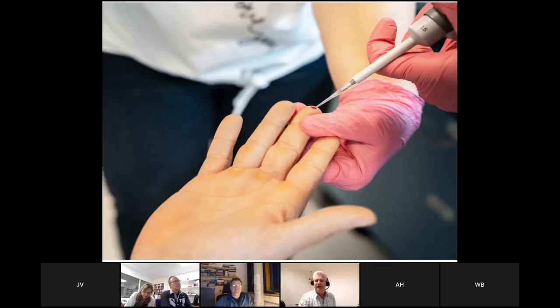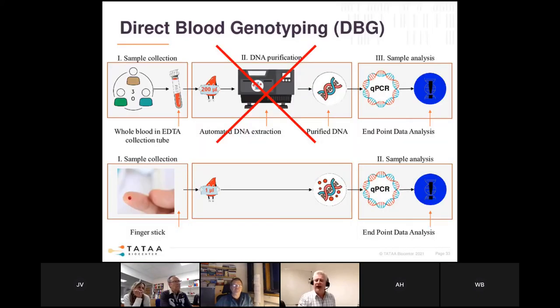And then finally, just a few slides of working out in the field. So this is a blood prick sample collected. What we wanted to do is, can we do a PCR directly on a drop of blood, essentially skipping DNA extraction? So working with the various detergents that we have been working with for over 15 years, we have a few products on the market like the Cellulizer. We were pretty successful optimizing this workflow.